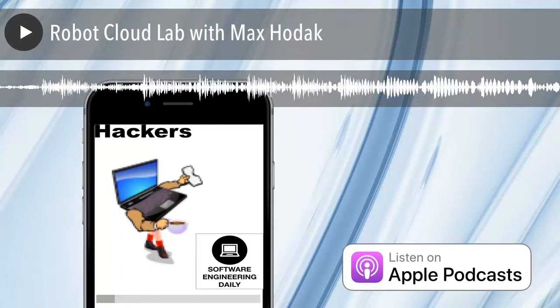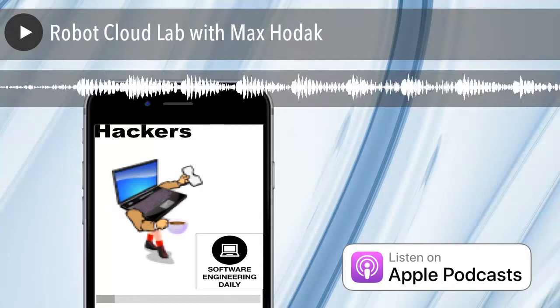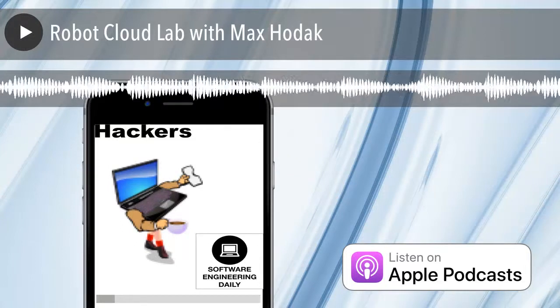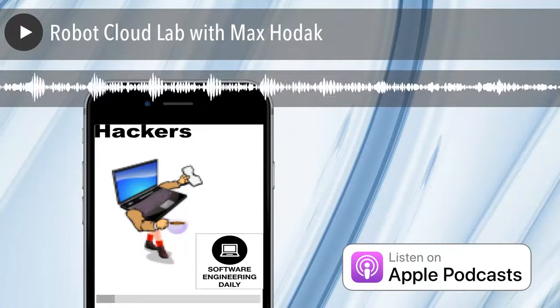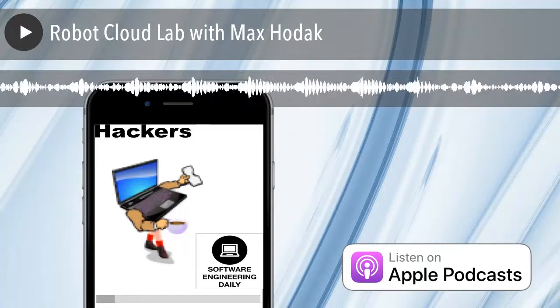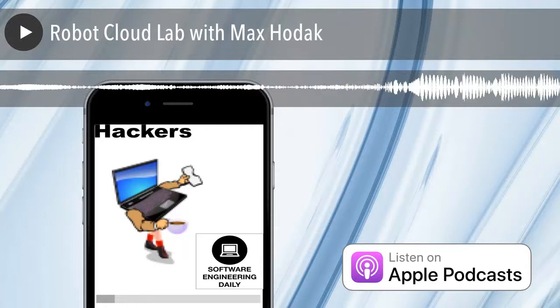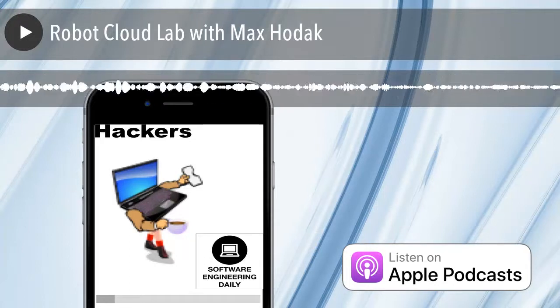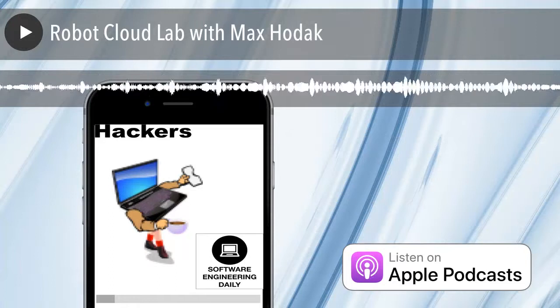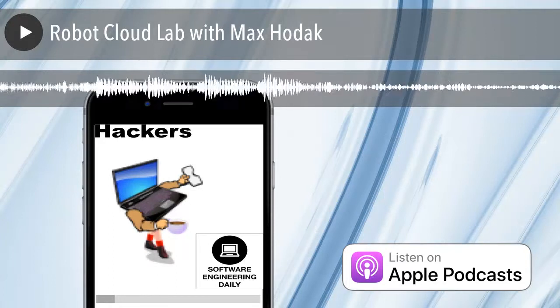And then we'll give them either an API endpoint for making a request to run that experiment, or scientists will log into a web interface at secure.transcriptic.com and select a little card for that experiment in the UI and set the parameters in a GUI. So whether you're submitting it programmatically or through the web interface, that then creates a run in a state, which I think is needs review, although that's mostly done automatically now, so it would immediately look like it's accepted.